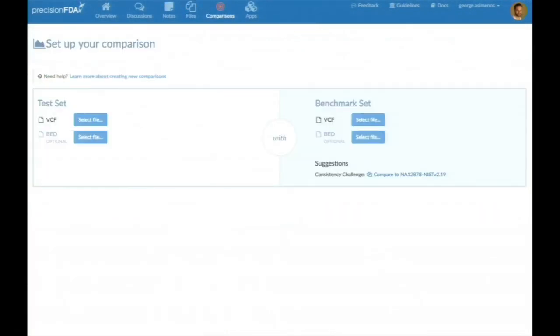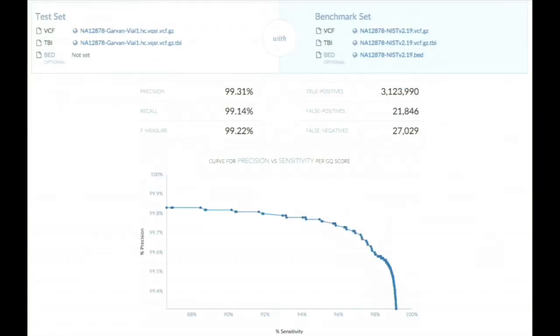They would do that by conducting a comparison. By setting up their comparison with a test set of their own VCF and using as benchmark set the aforementioned NIST file, they can take a closer look as to how their results compare to the NIST results. This is an example of people evaluating their performance of their pipeline using a known reference sample.